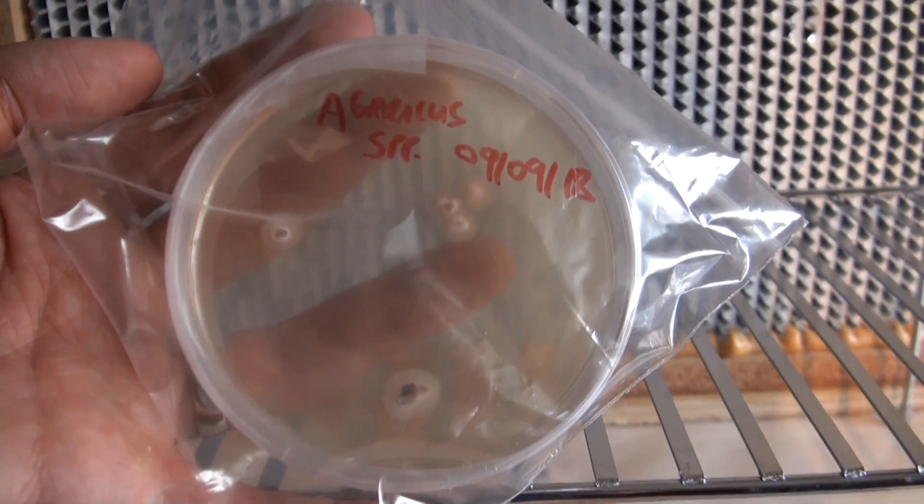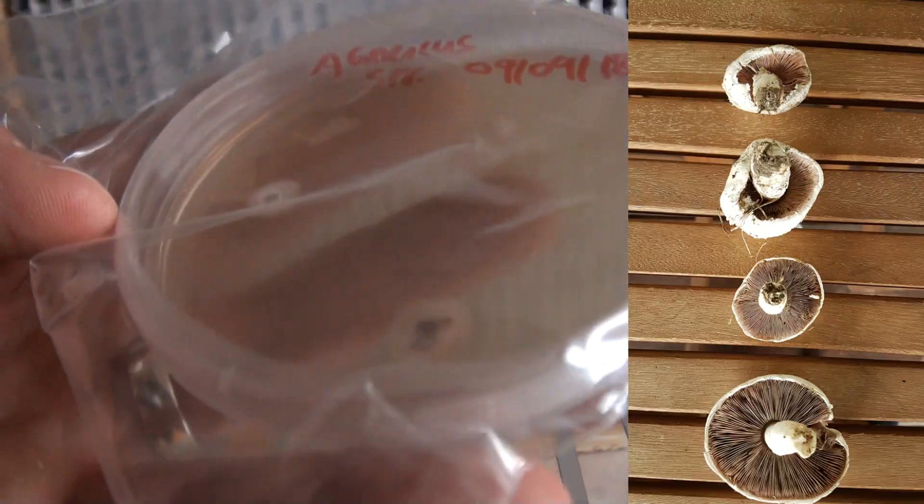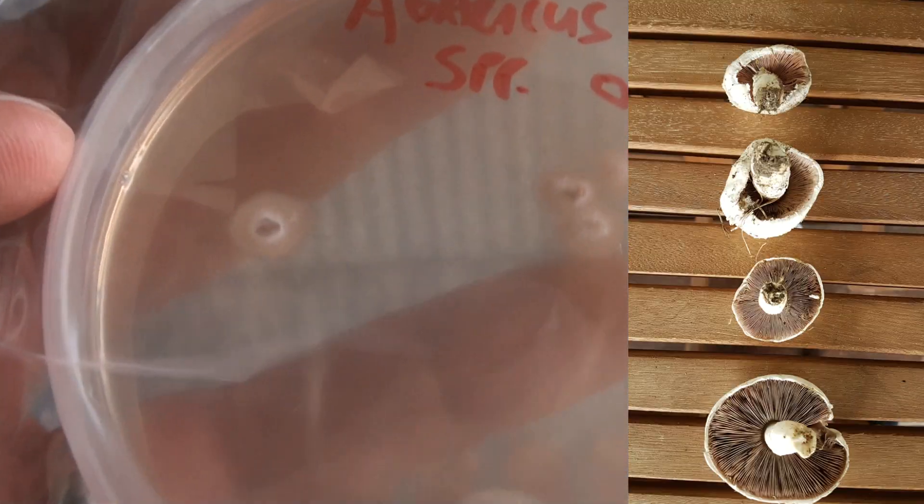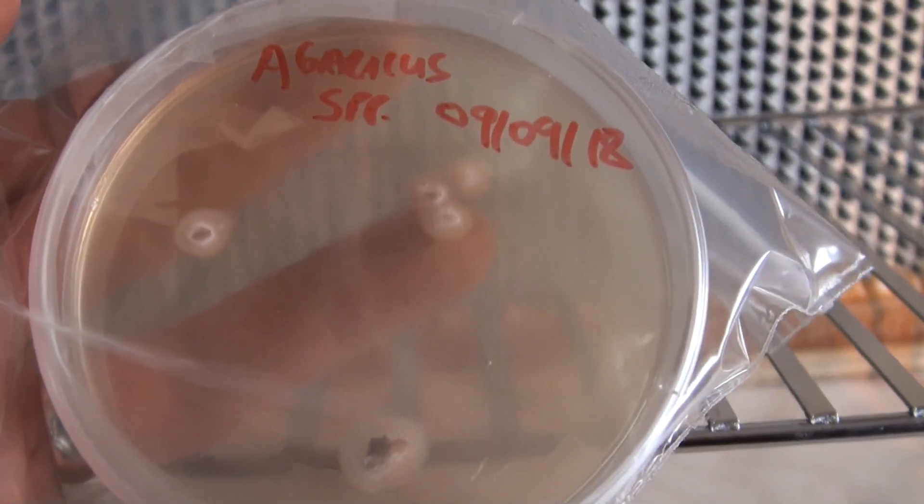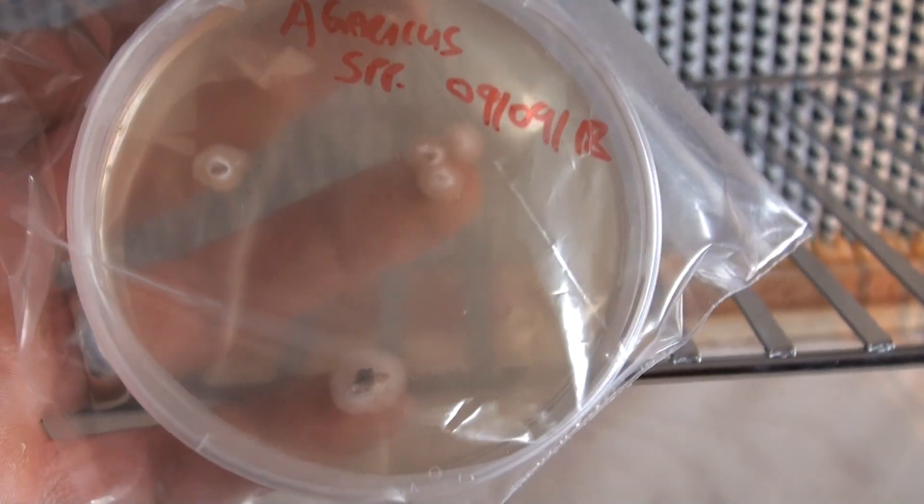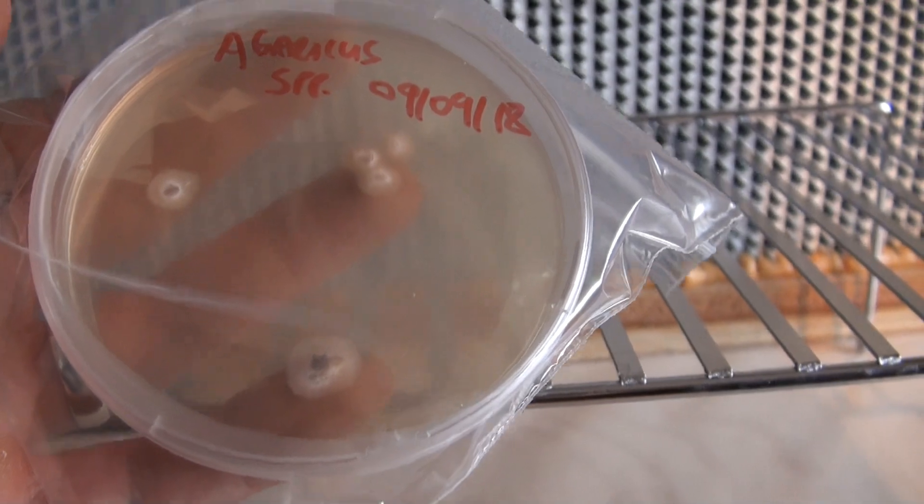Here's another one. This is an Agaricus species that I cloned. And as you can see, mycelium is starting to grow out from the pieces of tissue. Again, it doesn't look like there's any contamination here. But you never know. I'll have to do a few transfers just to make sure I have a pure culture.